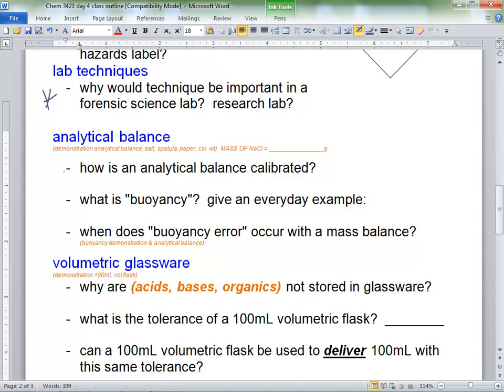Then I don't like to do math, so I'm going to tare it. What does taring do? Zeros it. Right. Okay. You notice when I pushed it, the whole balance moved? So it's not set up right. Whenever you're going to look at the balance, look in the back, and there's always a little level, and the little bubble should be in the center. I didn't take the time to do it, so you didn't see it happen.